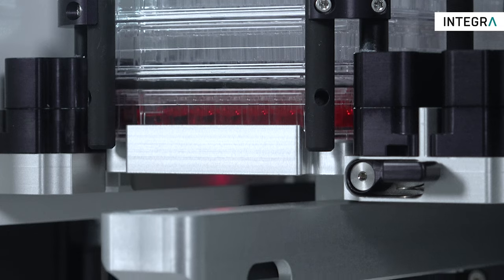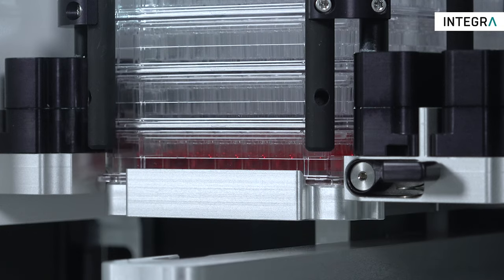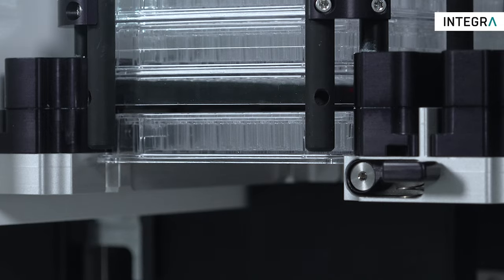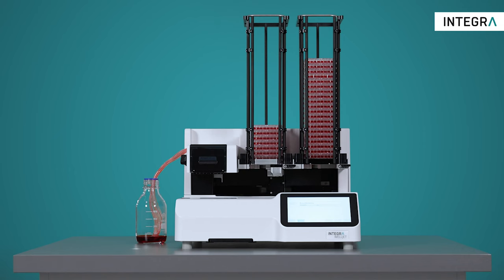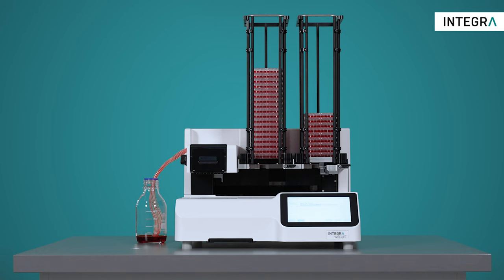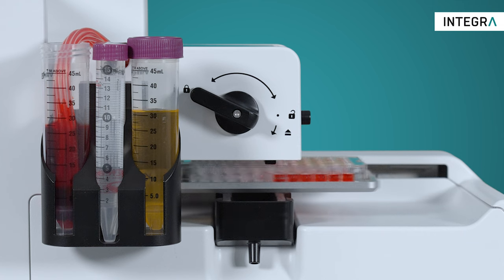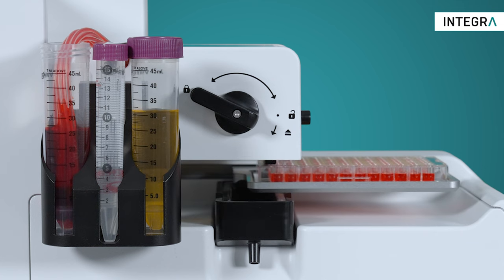With the integrated lid handling function of the dispenser stacker, plates with lids can now be processed faster and more reliably than ever before. Optional re-stacking of plates with or without lids maintains the original order, eliminating any confusion. To save valuable reagents, an optional tube holder is available for 15 milliliter and 50 milliliter tubes.